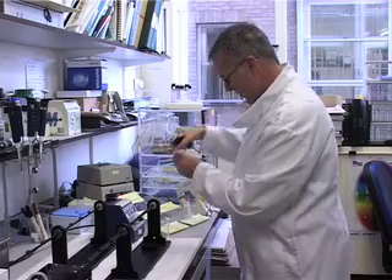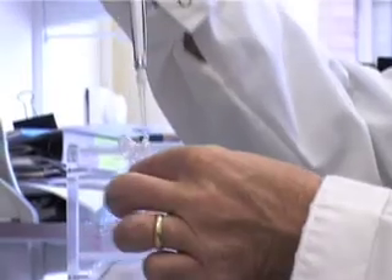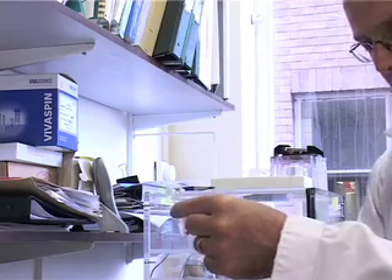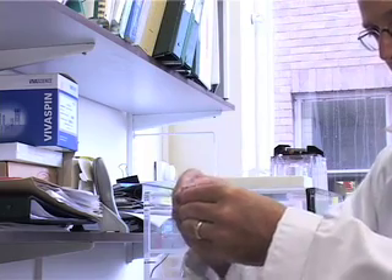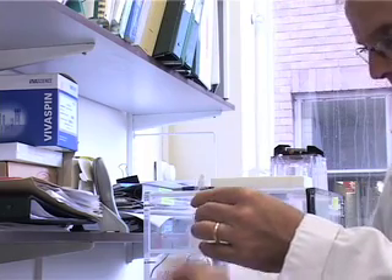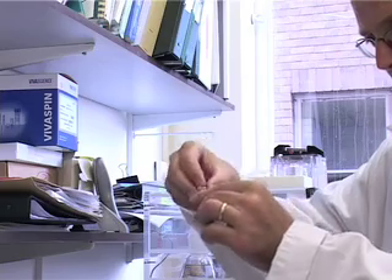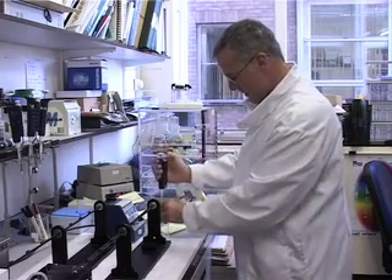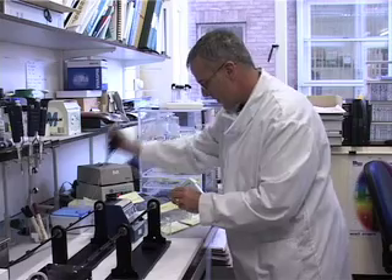Next, I add 50 microlitres of DNA into the gold and spermidine, again doing so with gentle agitation. This is sometimes referred to as a gold slurry.